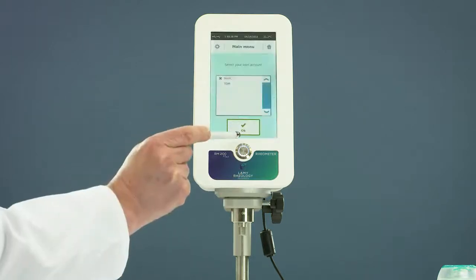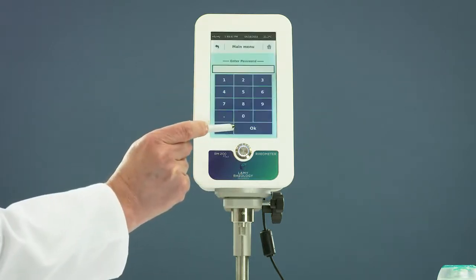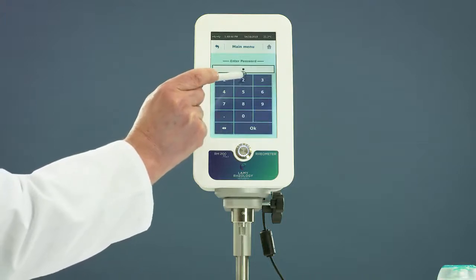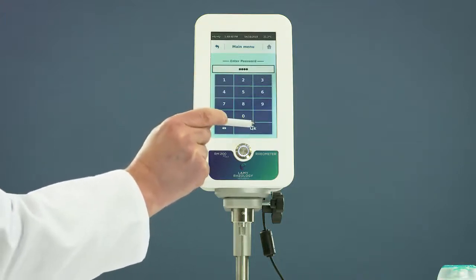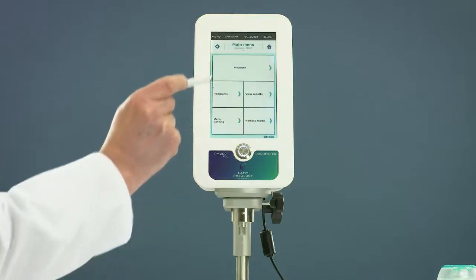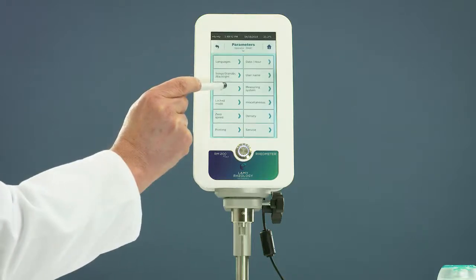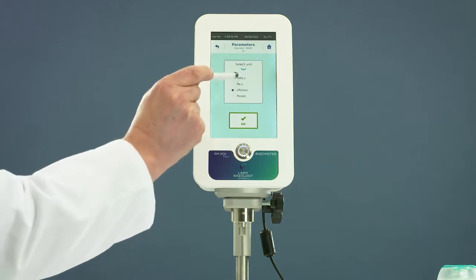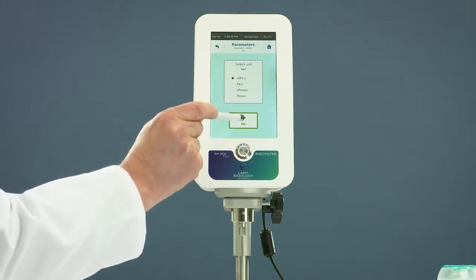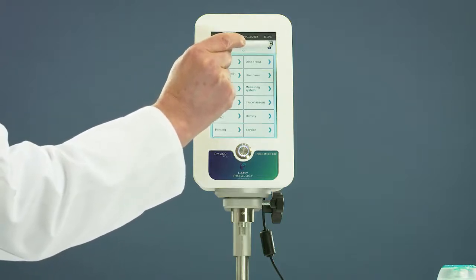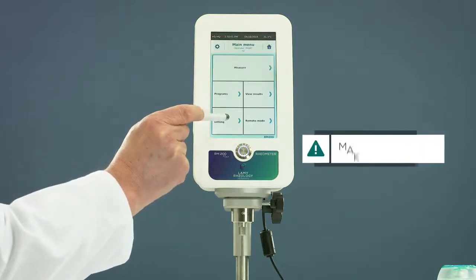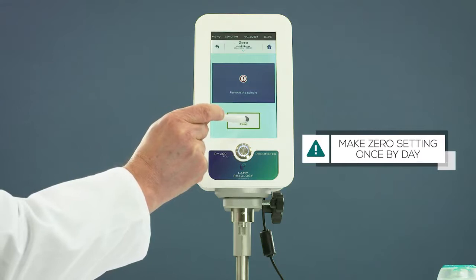When user mode is enabled, choose your account and enter your pin code. Choose a unit for the viscosity. Zero the device. You should make it at least once per day.